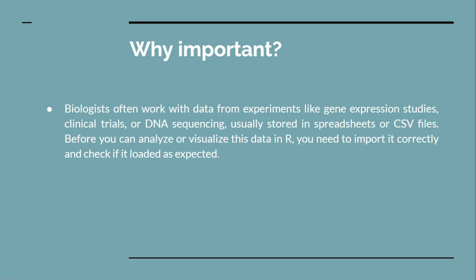Let's say researchers and biologists work with the experimental analysis and they used to generate huge amount of data sets, and those data sets are basically present within the .csv file formats or in the spreadsheets you can say. And before you can analyze or visualize the whole data sets into the R, it is very much essential for you to import the dataset correctly into your software so that you can check if the whole dataset is loaded correctly as you are expected.